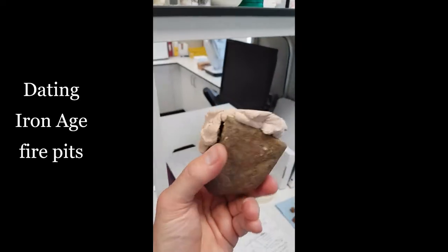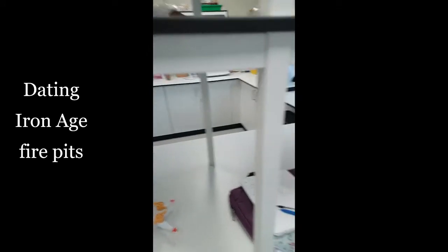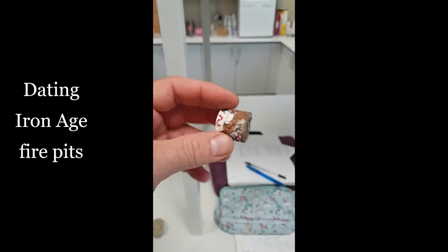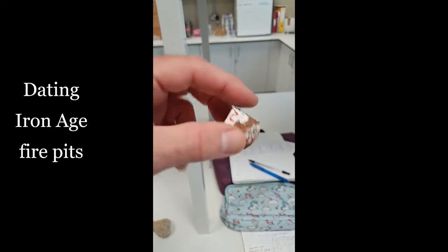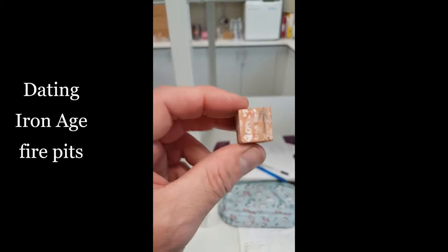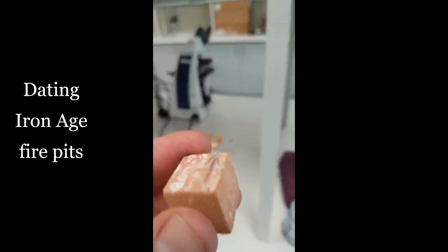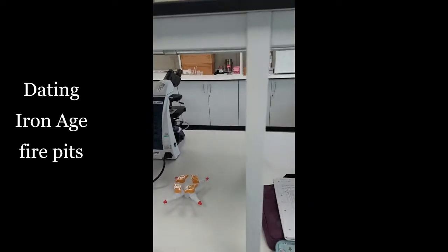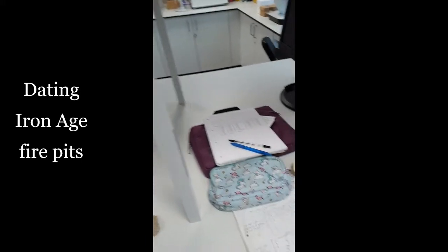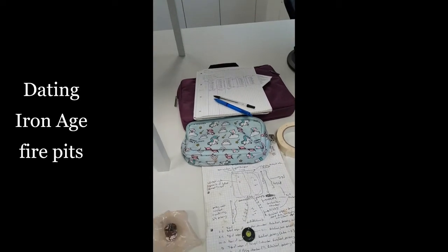Once in the lab, I take this pebble and I cut it into smaller samples so that I can study the magnetic memory of the samples. There are different ways that we can go about that. We can take that pebble and maybe drill a sample from it. So we might get a sample that looks something like this, a cylindrical sample, and we just drill into those pebbles. Maybe we cut cubes instead. Depending on how we want to go about this, we can take different ways of getting samples from those pebbles. Because we know where the horizontal was and where the north was in our pebble, we also know the horizontal surface and the direction of north in our sample.